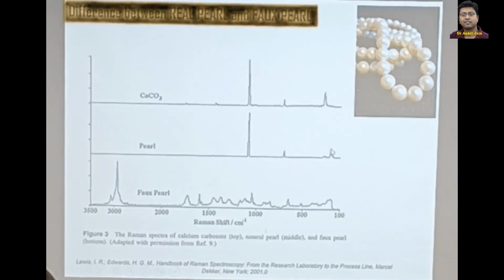But अगर वो सच बोल रहे हैं and it's a plastic pearl and it's not a real pearl and it's a fake pearl, that means it will have many CH bonds, many C double bond O bond, C triple bond N bonds. That means it's a polymer, and you will be able to see this kind of a signal. And that means they are right. तो उनको लेना मत आप वापस and अपने पास ही रख लेना and then buy a new one and gift it.